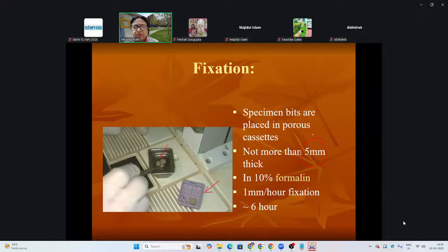So they have to be a certain thickness. If they're thicker than that, then this is going to get crushed, and you don't want that to get crushed. So it needs to be a certain amount of thickness, which can be done by the expertise. At the same time, whatever fits in here comes out to be of that same size, and it has to be centered so that there's going to be wax all around it.